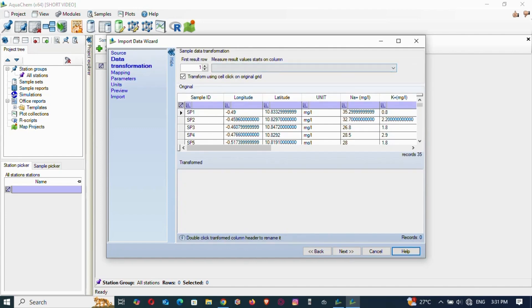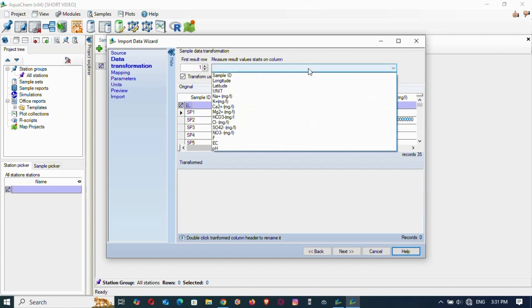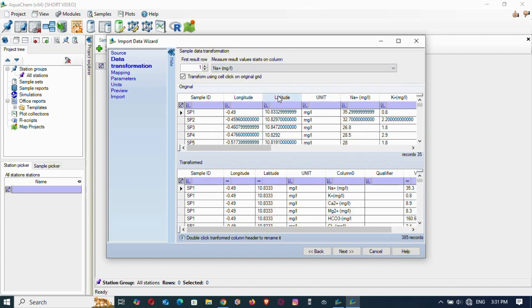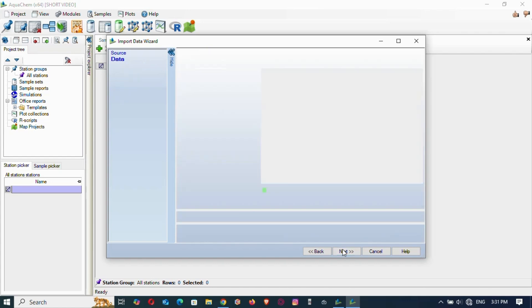Here it asks for the measured unit: which column your values start in. You can see the columns: Sample ID, longitude, latitude, units, then sodium. Sodium is the first measured parameter, so it begins there. Then proceed to Next.